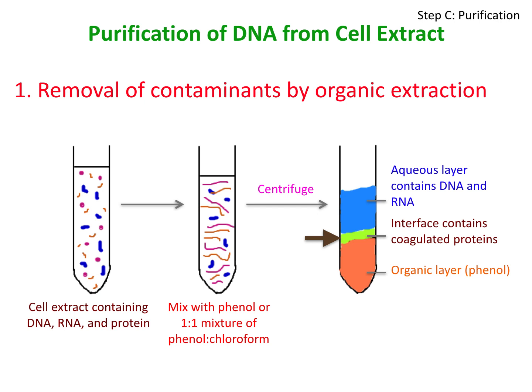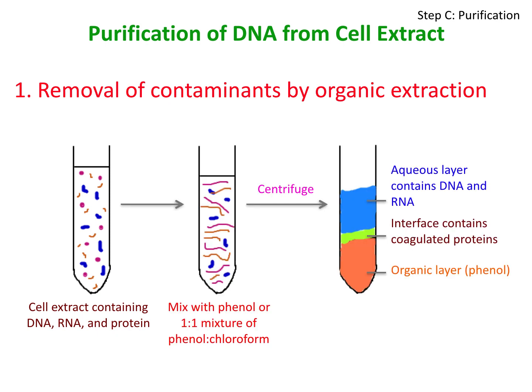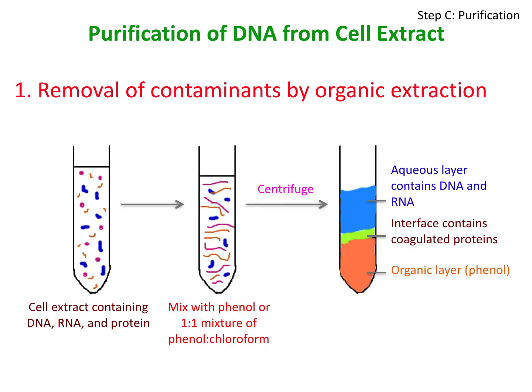Often, the cell extract has a very high protein content, and a single phenol extraction is insufficient to remove all the contaminants. The first solution to this problem that one can think of is to repeatedly treat the cell extract with phenol, or in other words, repeatedly add phenol, centrifuge and pipette out the aqueous layer, and you continue the process until you get a clear interface, which means that all the protein has been removed from the solution. But this method is generally not used. The reason being that with every mixing and centrifugation step, a small fraction of the DNA molecules undergoes breakage.